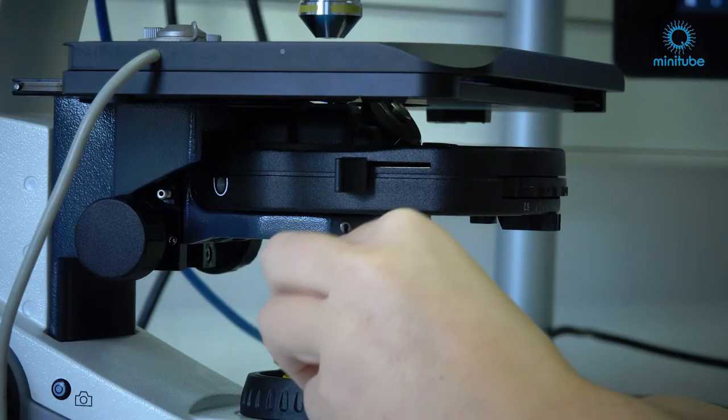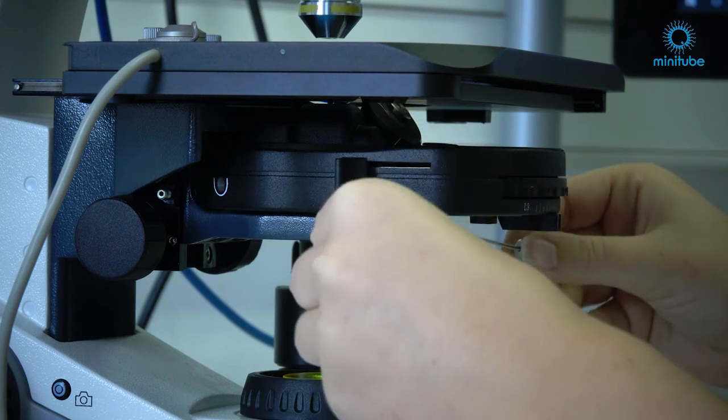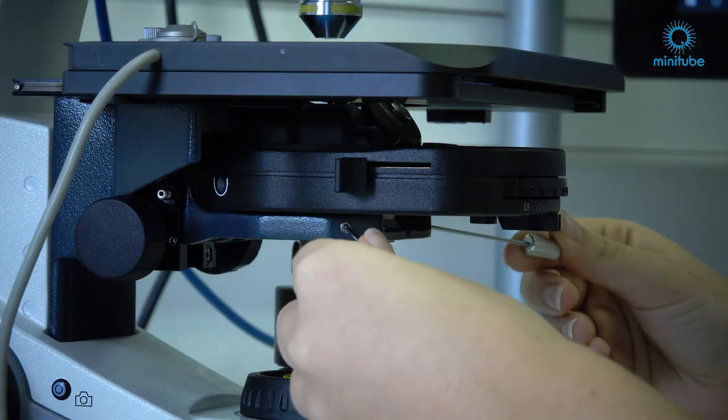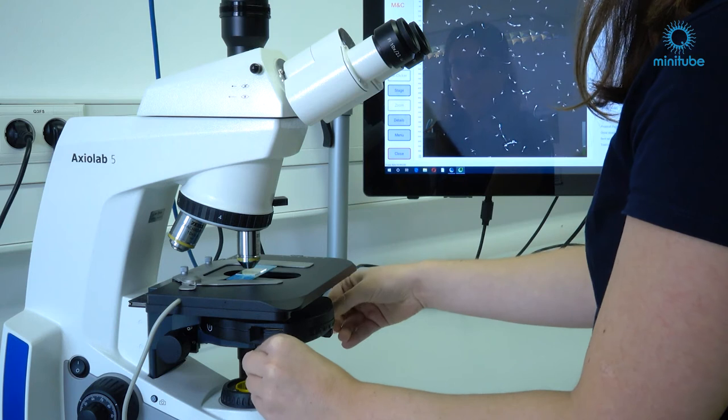Use the two screws on both front sides of the condenser. Now center the field diaphragm image with these two centering screws on the condenser carrier.